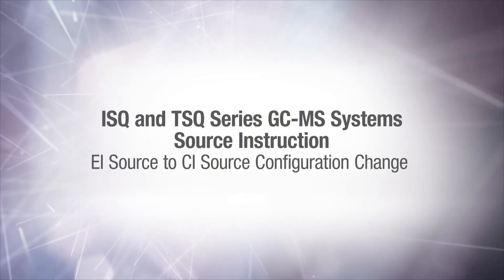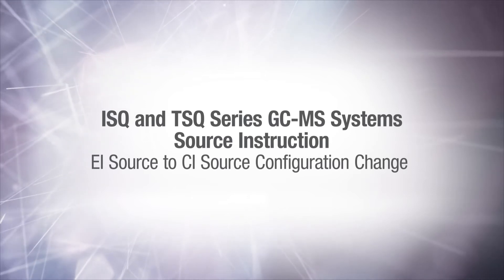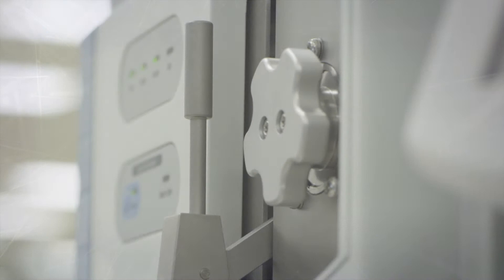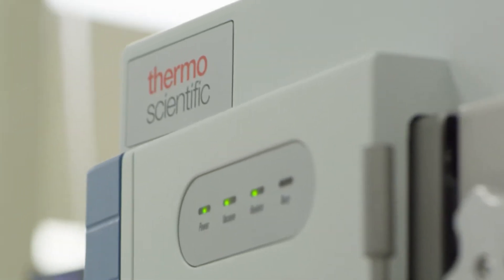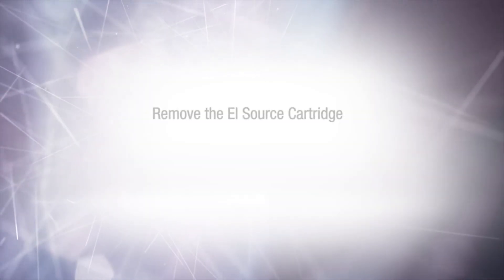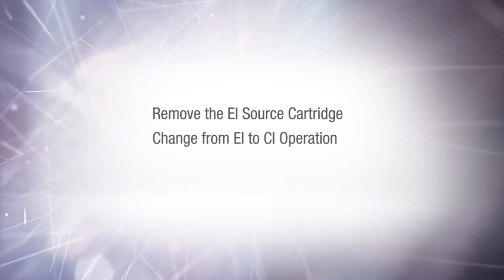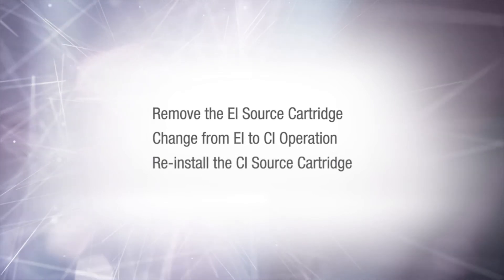Hello and welcome to the ISQ-TSQ series source swap instructions for changing from EI to CI source configuration. In this video we will demonstrate how to change the instrument configuration from EI source operation to CI source operation. After watching this video you should be able to remove the EI source cartridge, change the source configuration from EI to CI operation, and reinstall the CI source cartridge.